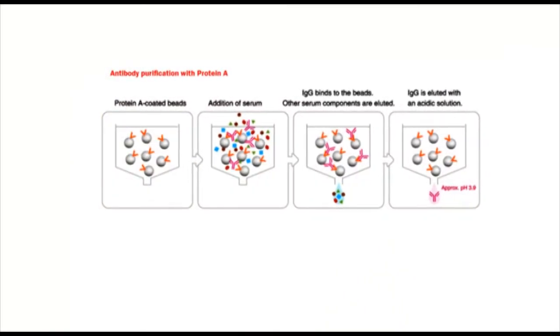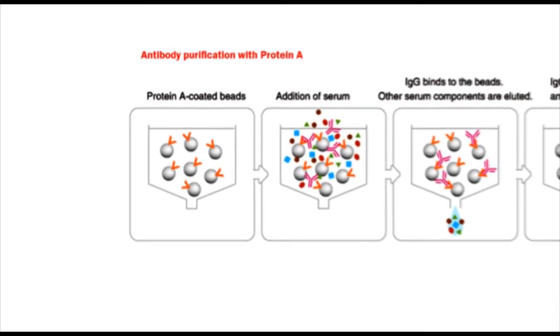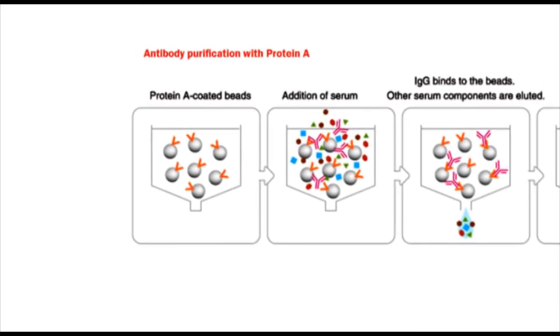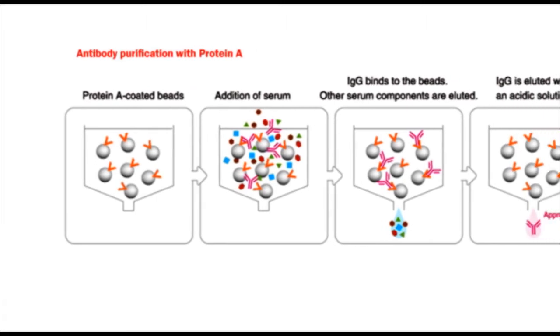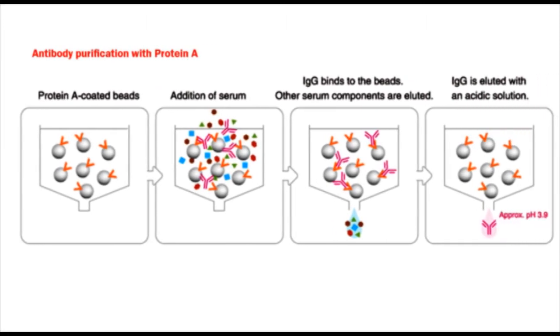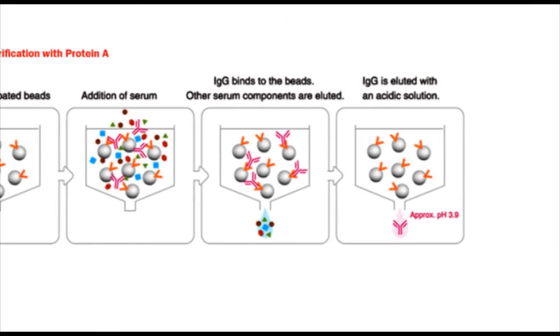Immunoglobulin binds to the protein A Sepharose column at pH 8 and it is eluted at a lower acidic pH. One limitation of the protein A affinity column is the use of eluent buffer with low pH, which can change immunoglobulin conformations.